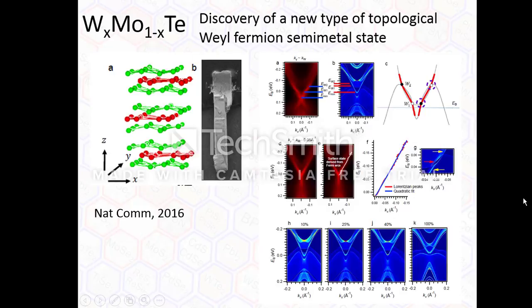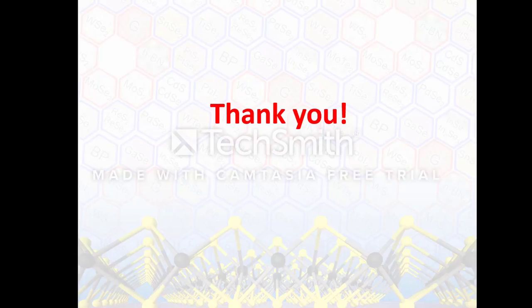the very good evidence. I'm not a physicist, so I won't spend a long time on this. But what I can share with you is if we tune the concentration here from 0 to 100%, we will see this material go from a kind of topological insulator to a Weyl semi-metal at a certain concentration. All right, I think that's pretty much it. Thank you very much.